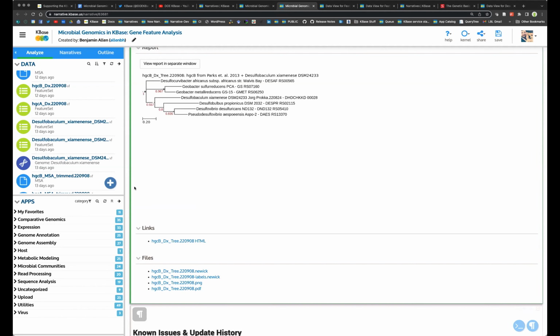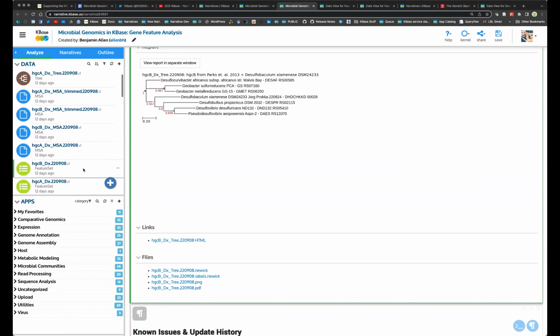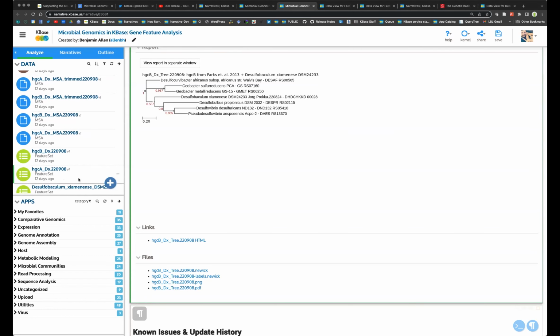I want to show just a couple of other things before I get into some of the questions, if there's any questions that are there. Just want to show you a couple of cool things you can do in KBase. So we built out this new feature set here.